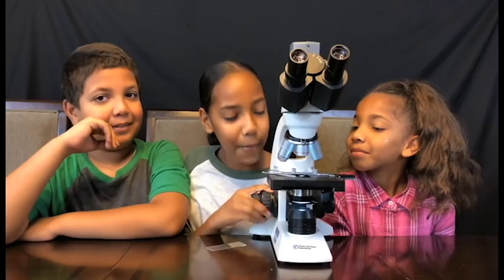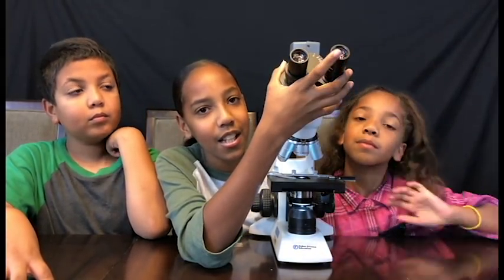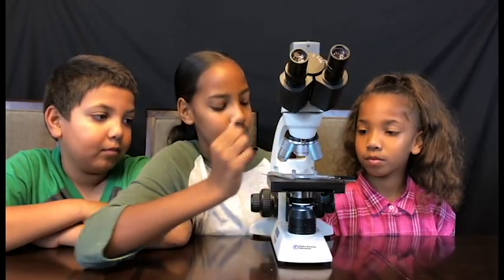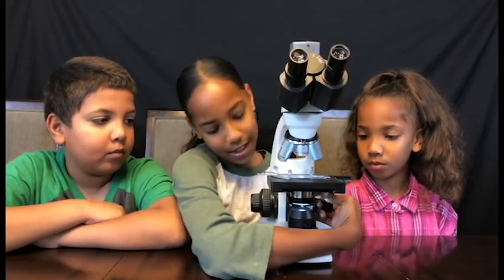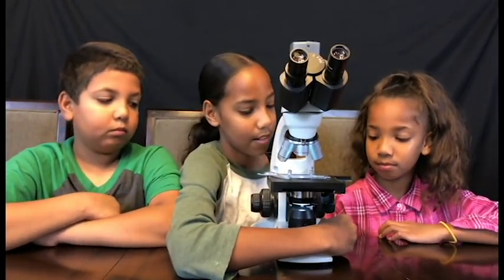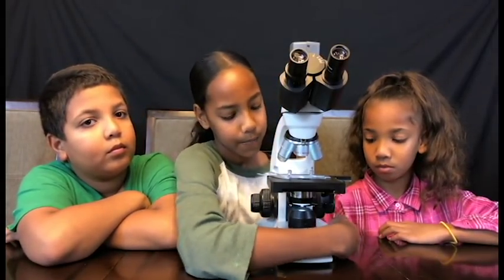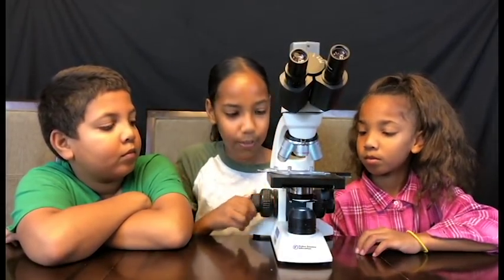I'm going to be describing to you how a microscope kind of works — a short description. So these are the lens, which is the part you look through. They look like binoculars. This is the stage where you put a slide on with whatever you're going to look at, and you can adjust the slide position with these knobs. There's a light that you can make brighter and dimmer with this knob, and then these are the fine adjusters and the adjusters.